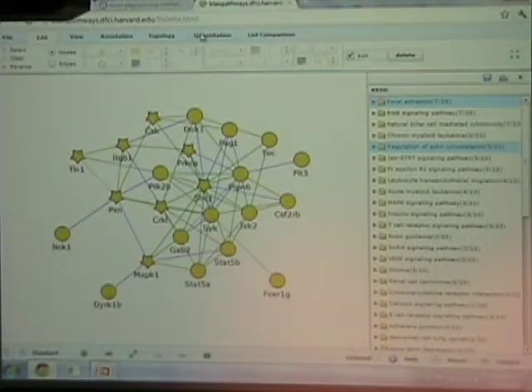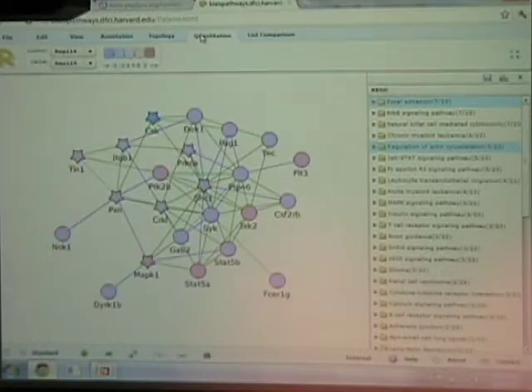The other thing that you can do, which you can also do for microarray data in some sites out there, is look at the ratios and color code based on that. You'll recall one mutant we labeled with iTRAQ 116, the other was 117.